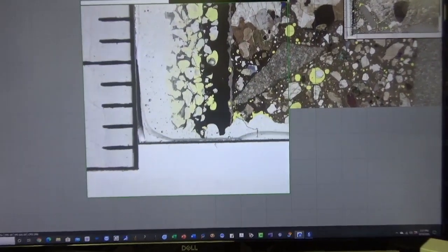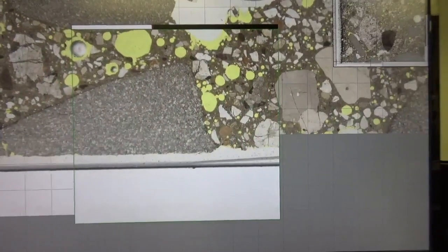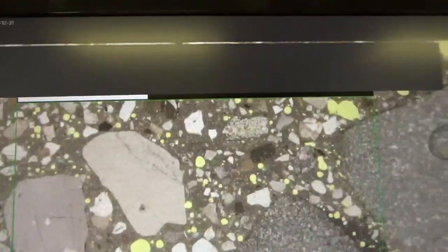There's the last scan. That's the end of the slide. You see the focus bar is always at the maximum level to have the sharp focus during the scan, and this speed is pretty comfortable to go.